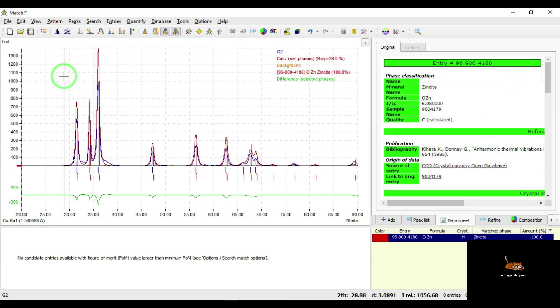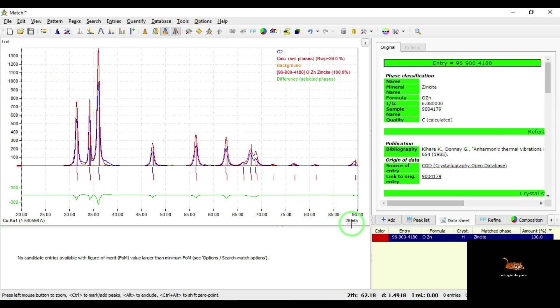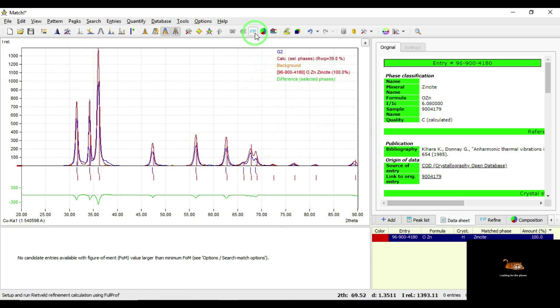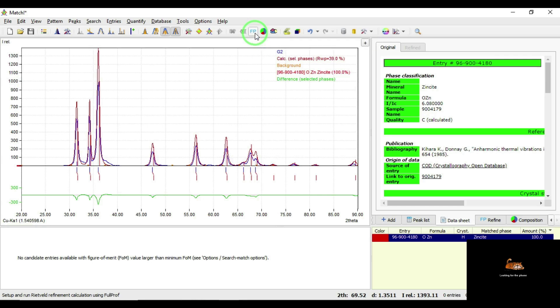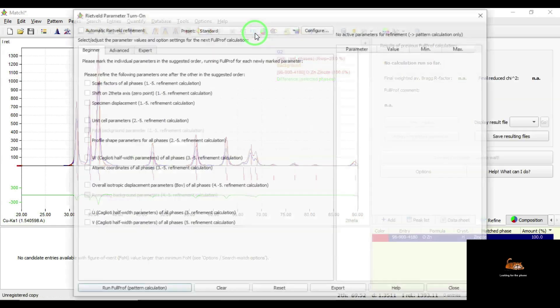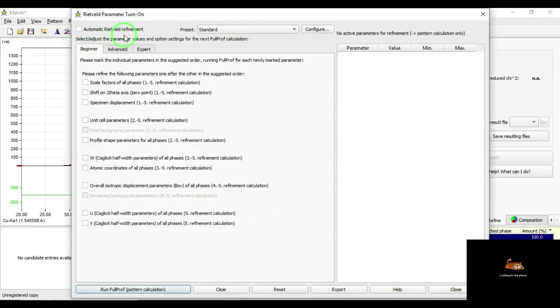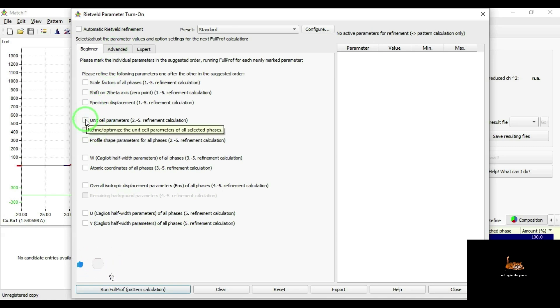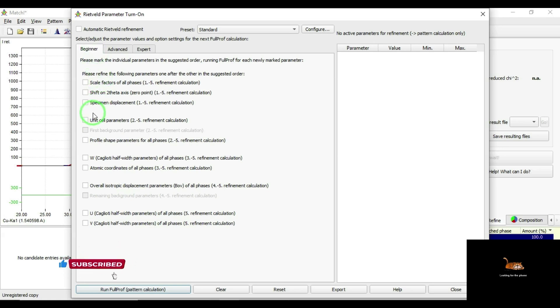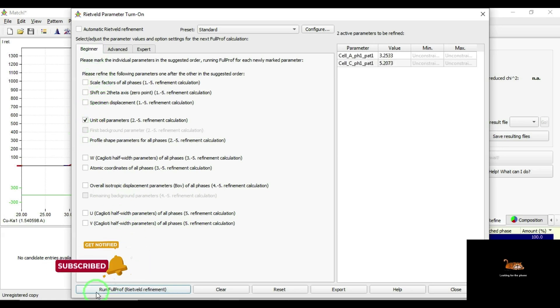I am going to compare my obtained sample data with respect to this standard database. I am going to click on F.P. — Full Proof Suite — which will calculate the lattice parameters and other structural parameters. You can do automatic or Rietveld refinement by selecting each option. Here I am interested in calculating lattice parameters only, so in beginner mode I am selecting only unit cell parameters and running Full Proof Suite.